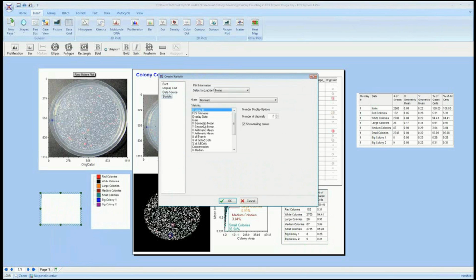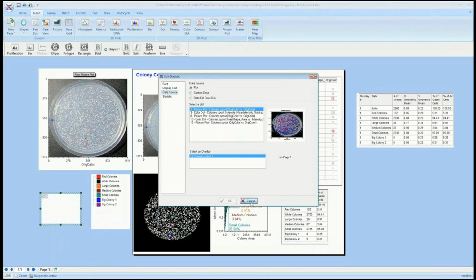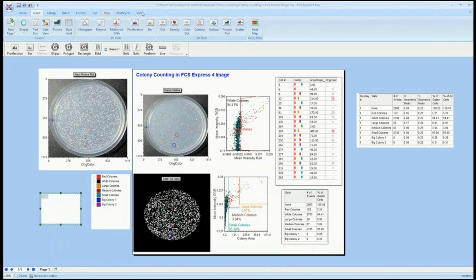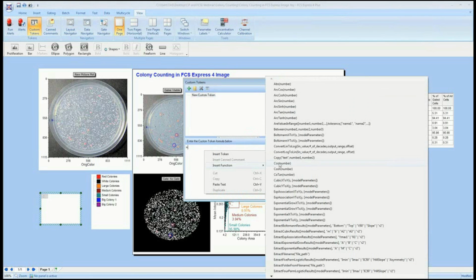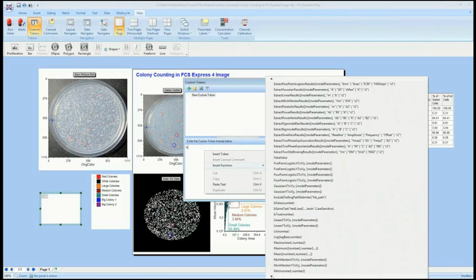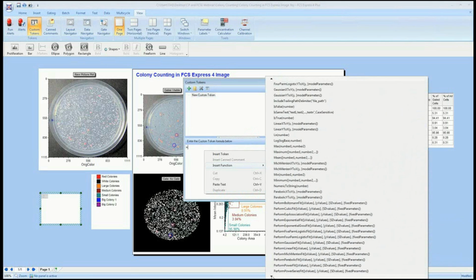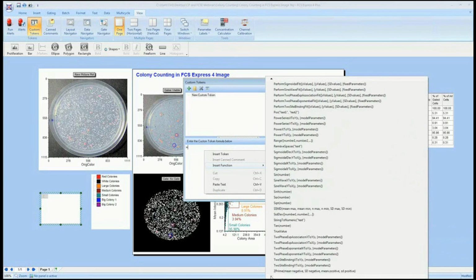And you'll notice here that these tokens can come from any of the statistics. Actually, that one doesn't make a lot of sense. But the idea here is that with tokens, we can also create custom tokens or formulas like you can in Excel. And when you do this, we have the ability to use any type of function that you can imagine mathematically. You can see here that the list is actually quite exhaustive. But these can all be used to do your analysis and get statistical comparisons.